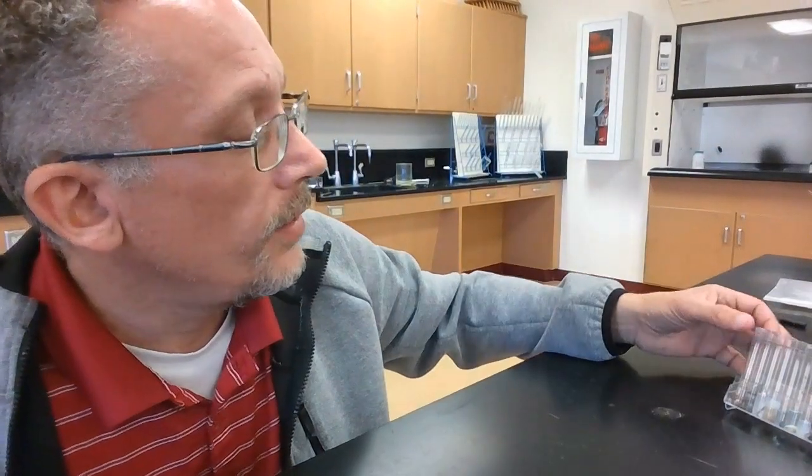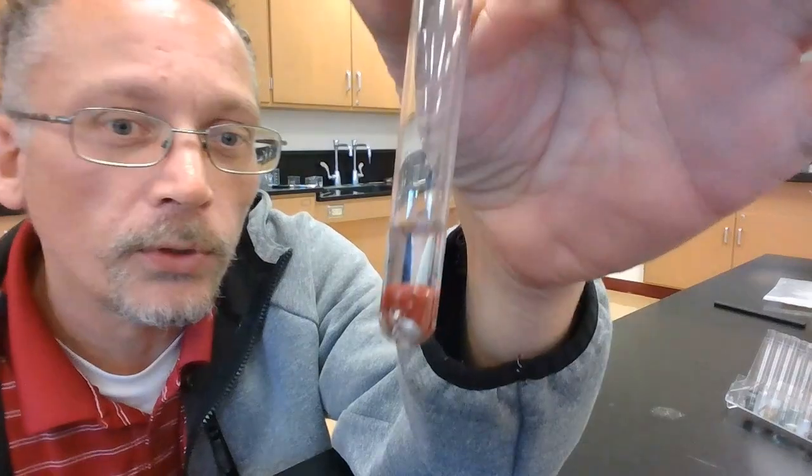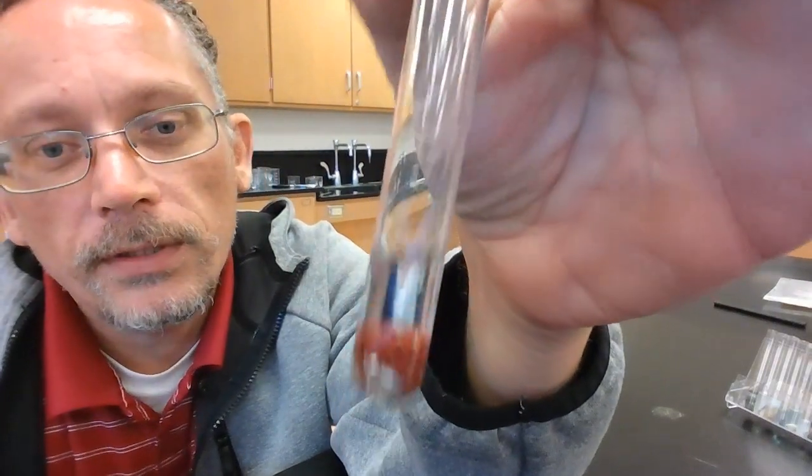Hey, so I have left these test tubes here for a little while, and I came back, and some of the reactions are now quite obvious. If you take a look at, here was the aluminum with the copper 2 chloride. You can see it's grown this brown stuff. That brown stuff is copper, and the blue has gone out of the liquid. It's now clear.